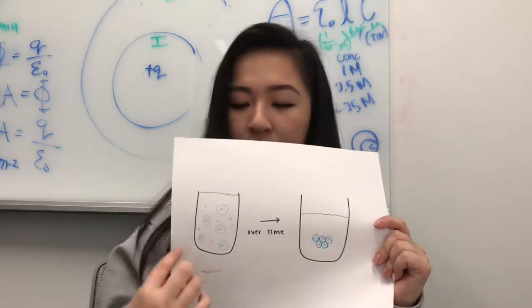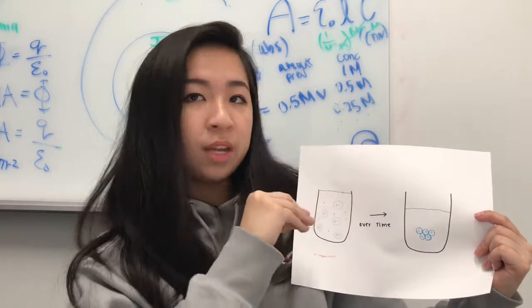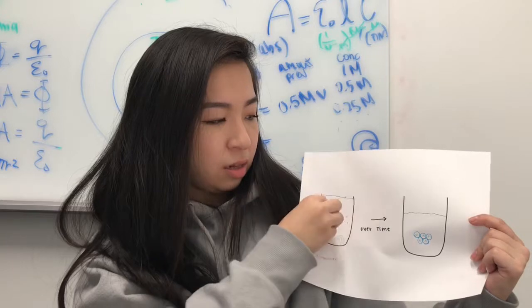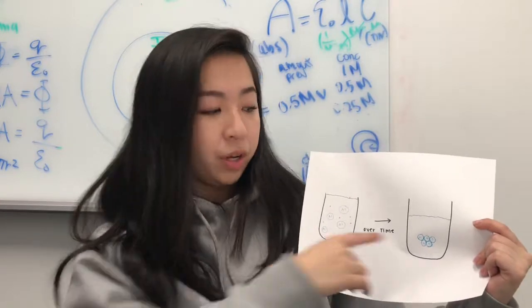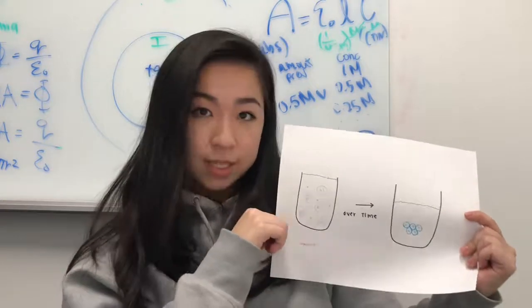the Al ions that we see, the blue parts right here, will find each other and join and form crystals over here. So as the water is evaporating, the Al ions find each other and form the crystals. So the joining of the mineral atoms creates recurring patterns that form the hard, strong crystals, which is called the process of crystallization.